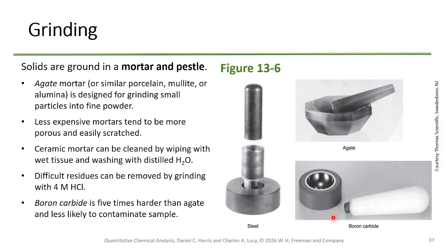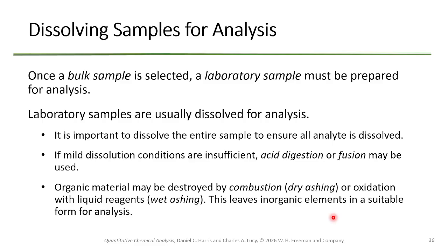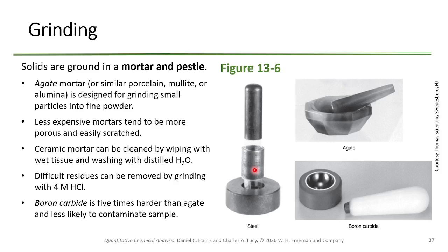Okay, grinding. You did this one. Remember you did an acid digestion with grinding, right? To get your iron out of your tablets. Hey, guess what? Acid digestion, right there. Right here, grinding with mortar and pestle. Okay.